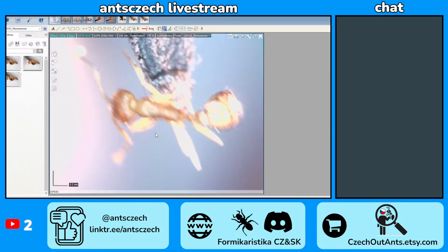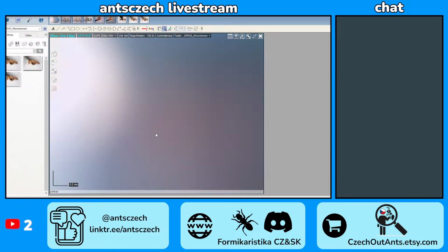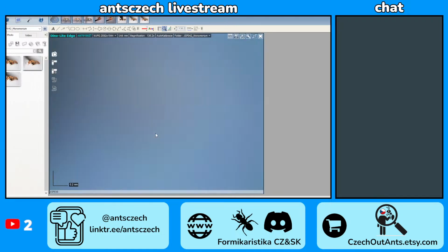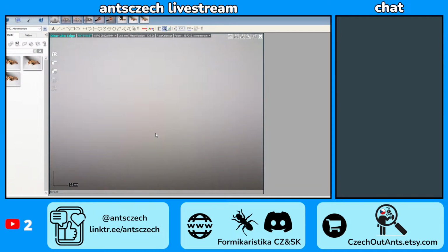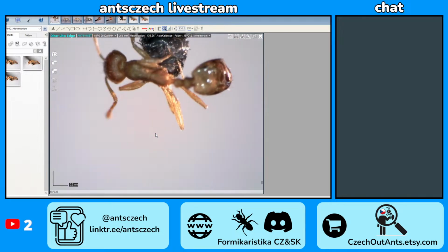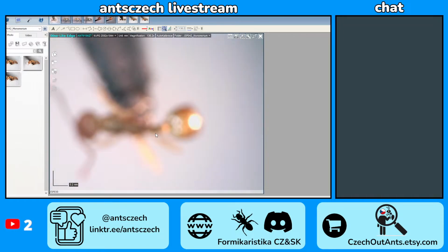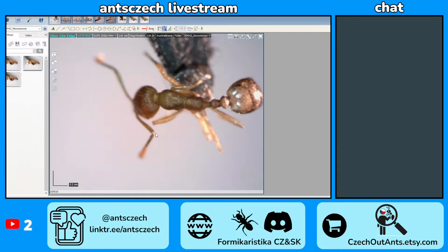Let's see if there's a key, just to exclude at least a few species. Better at least some. Key to species in the genus: Afrotropical, West Palearctic, US, India. India is so different. This hurts. But hey, at least there's enough work to do for future myrmecologists. Yeah, that's true.